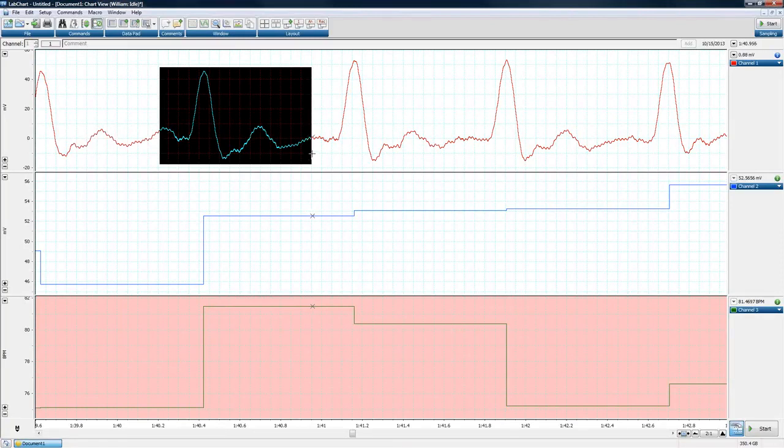The next option is, what I've just shown you is the easiest way to do it, but it's probably the least precise, meaning that you're not being very discriminative of how you are making that selection. What I can do, though, is be very precise both about the x-axis and about the y-axis. Let me show you how to do that.